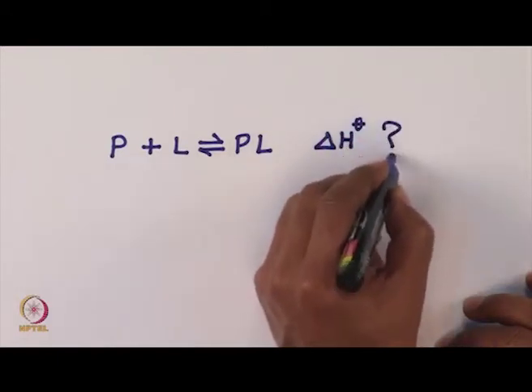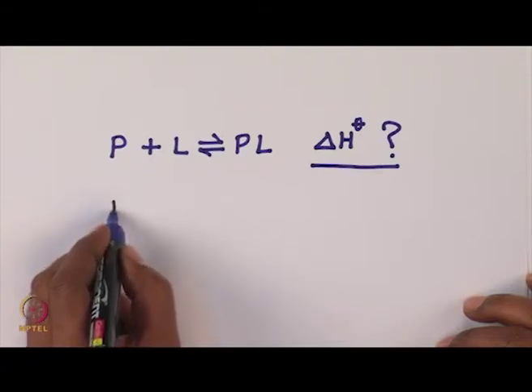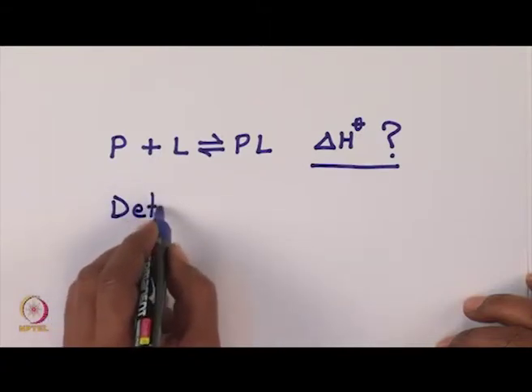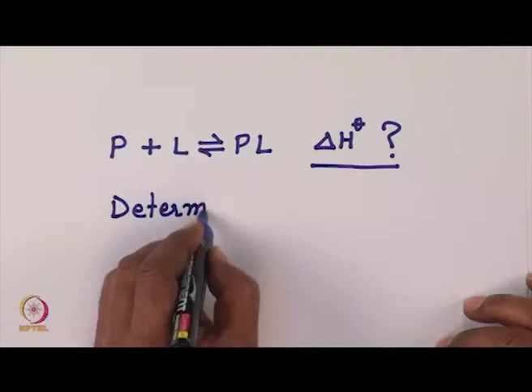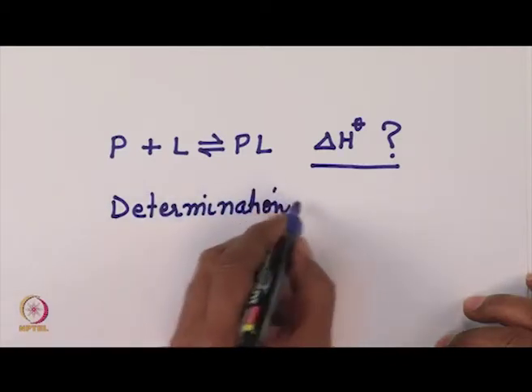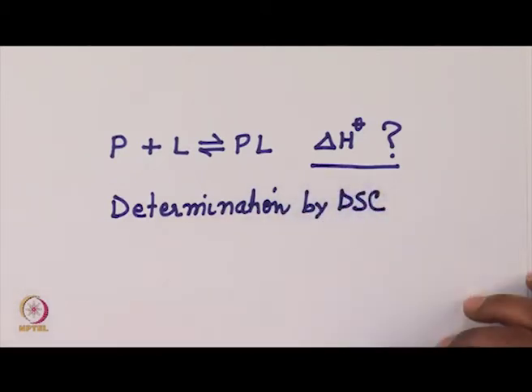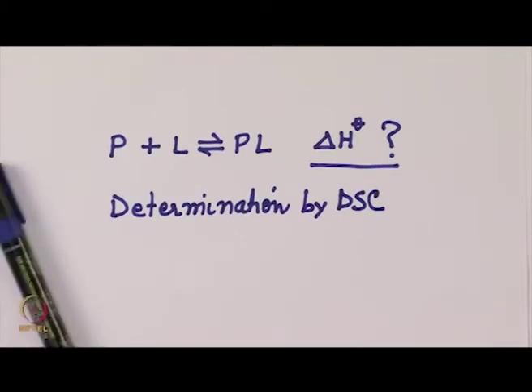This is the question. And we want to discuss determination by DSC.